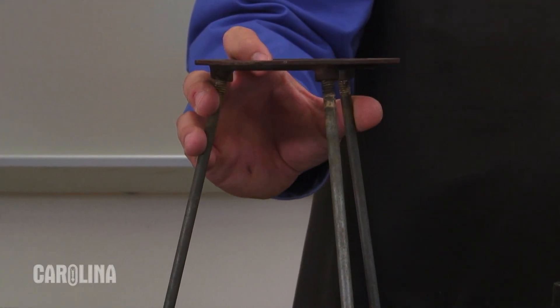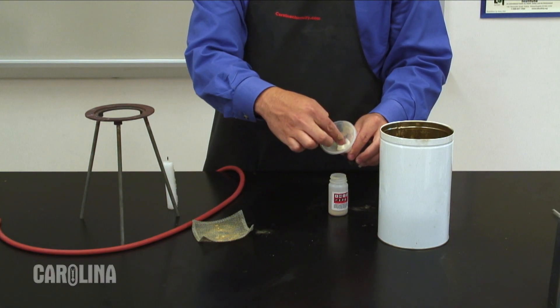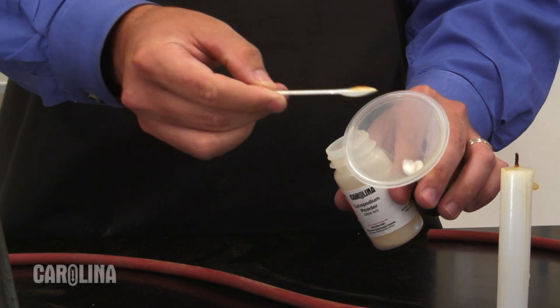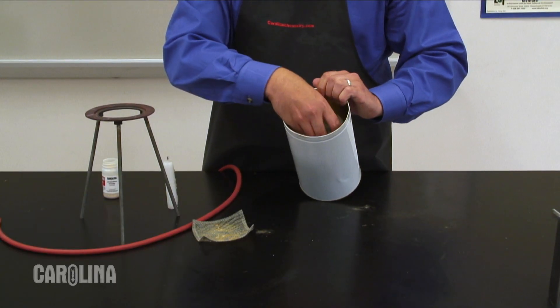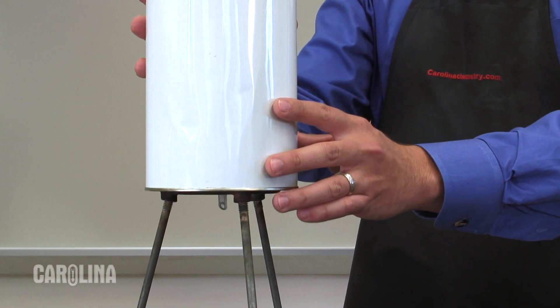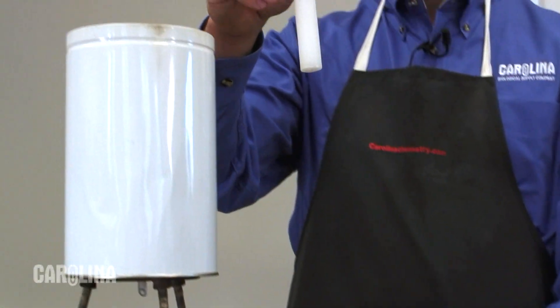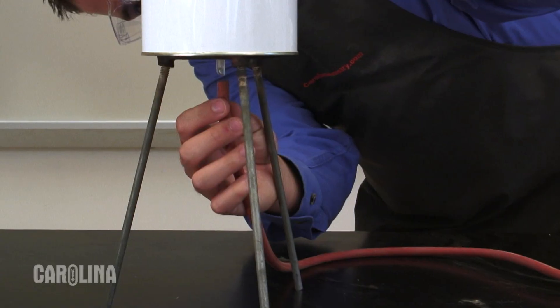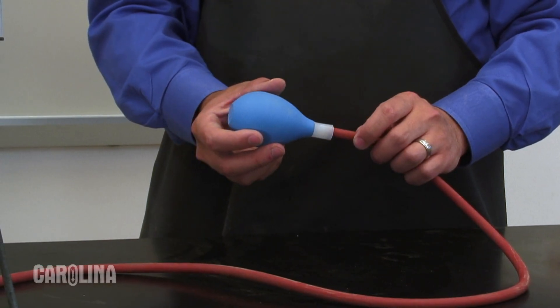We can further intensify this reaction by adding additional fuel. We will prepare the apparatus for this step using a funnel placed through a one-hole stopper. Put a small amount of cotton at the bottom of the funnel and place a spoonful of lycopodium in the funnel on top of the cotton. Place the stopper into a metal can and mount the can on a ring stand or tripod. Position the wire mesh on top of the funnel in the container and place a candle on top or just to the side of the funnel. Attach the rubber tubing to the bottom of the funnel and connect the rubber bulb to the other end of the tubing.